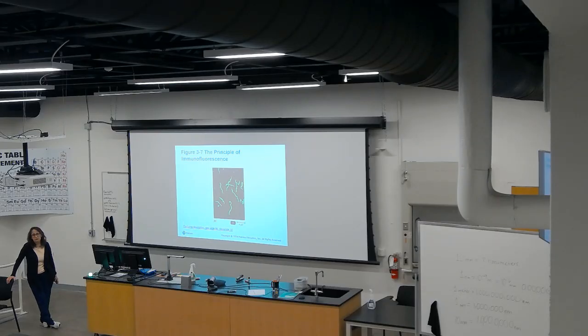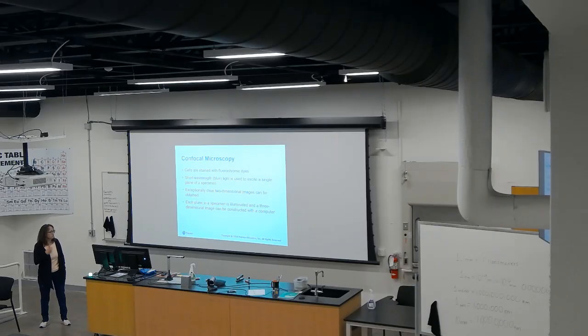An example, this is Treponema pallidum, stained with immunofluorescence. This is one of these bacteria that you need to wear double gloves when you're handling, because this bacteria is highly motile in a corkscrew manner, and sometimes it can even penetrate through gloves. They go to your skin. Any questions?